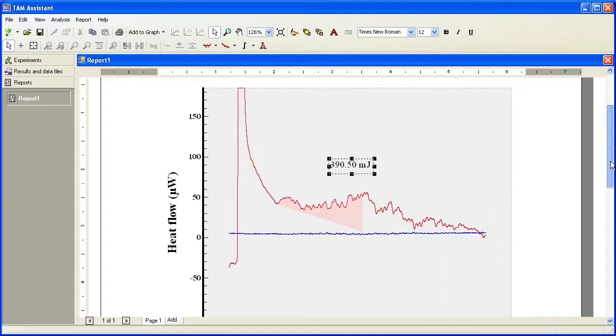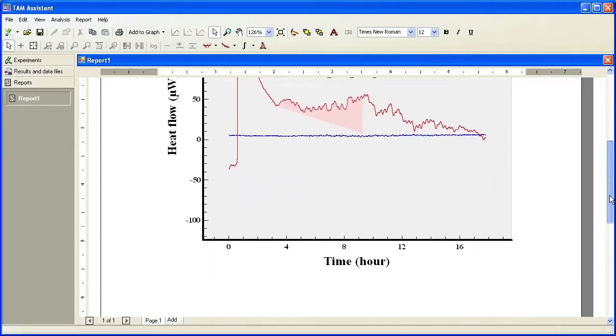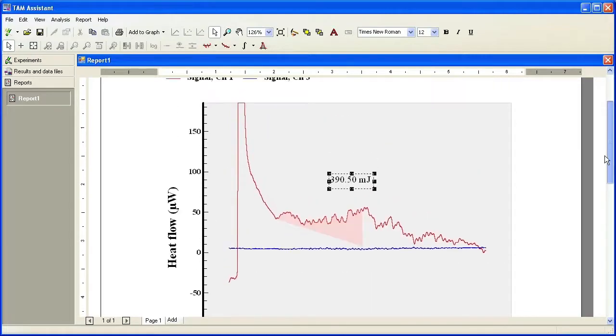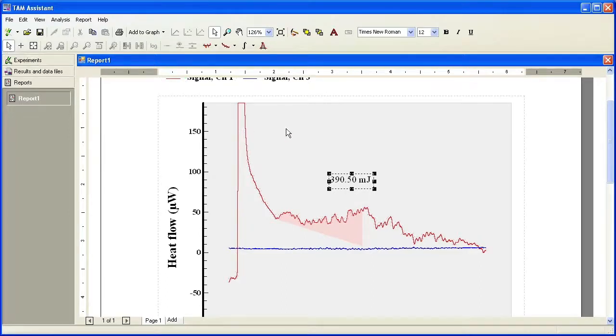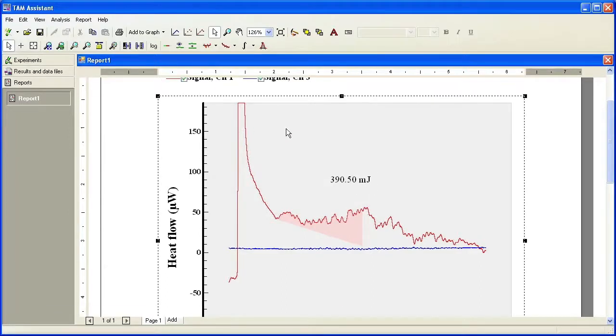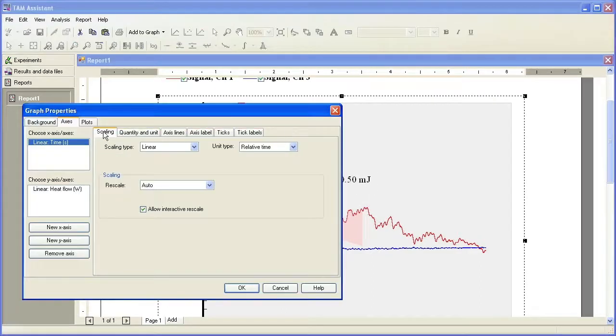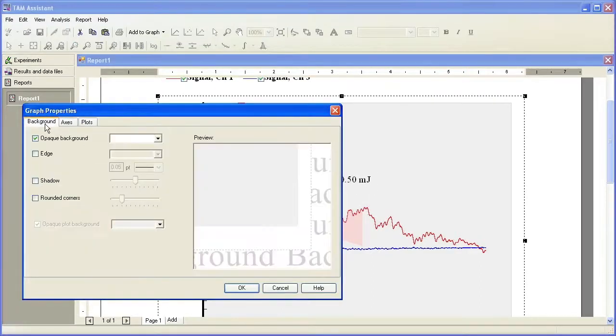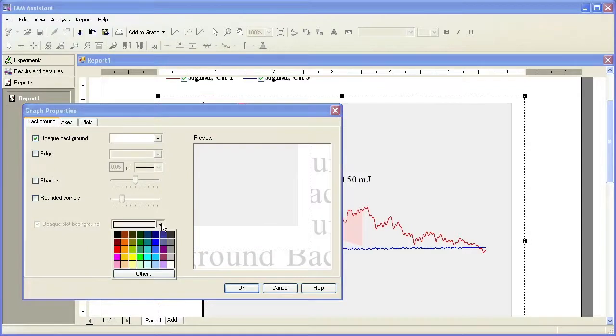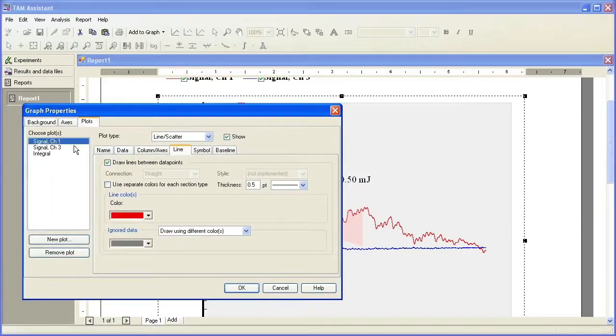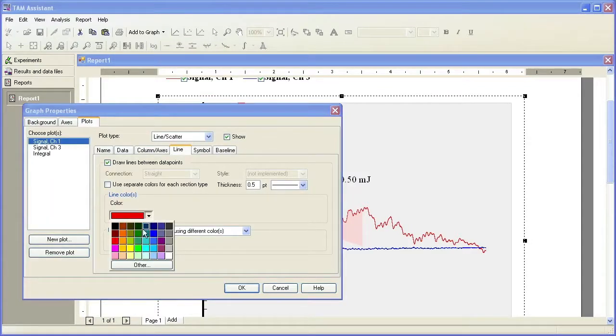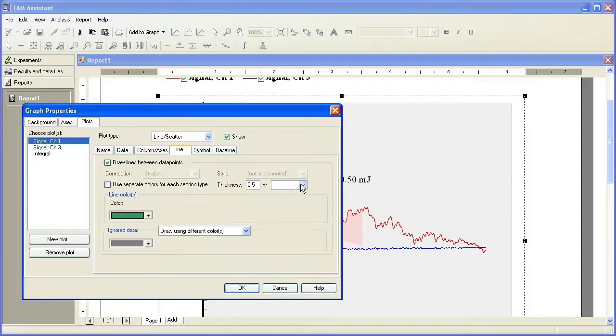If you wanted to change the color of the background or the curves, you can enter properties of the plot by using the data selection mode or enter selection mode. Double click, and you can go to the background and change it white. You can go to the plots and pick each curve and choose different colors or different thicknesses.